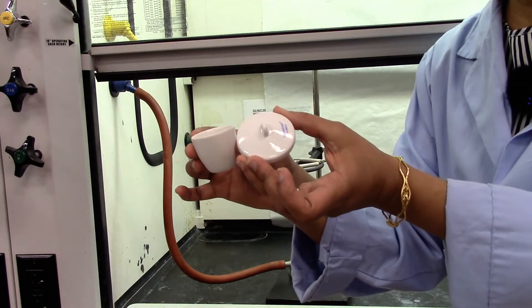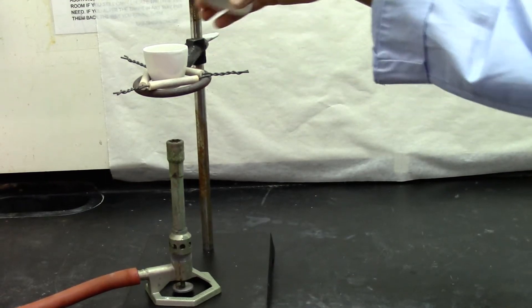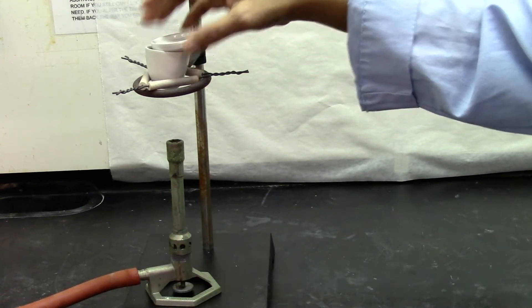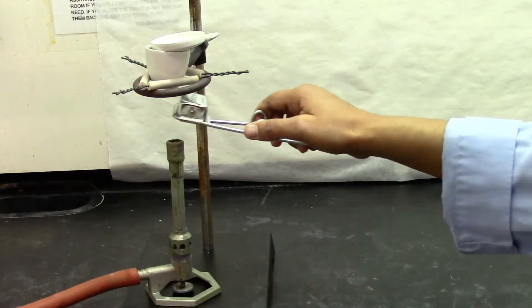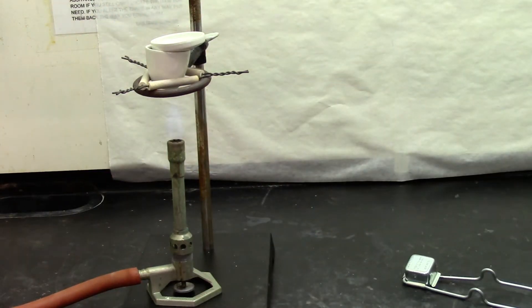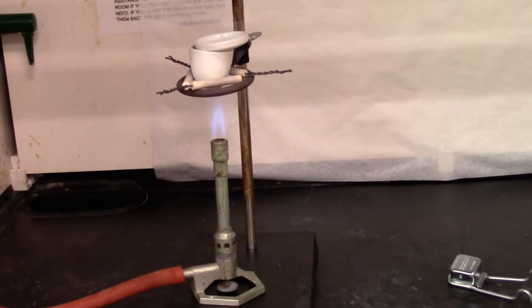That's my crucible with the lid. I'm going to place it on the clay triangle. So I'll cover it and then turn on the gas. Make sure to have a blue flame.